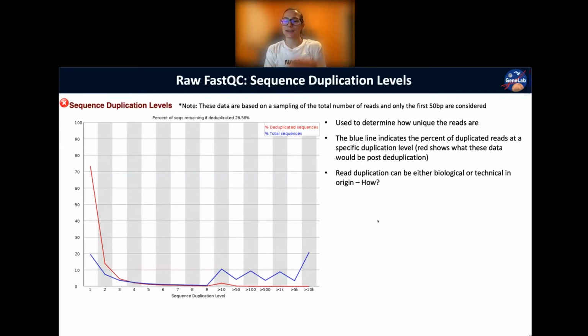although we try, with the divalent cations when we do our chopping of our mRNA, to make that as random as possible, it's always going to have some biases. So if you have exact copies of a transcript, so really high expression of a transcript, when you do the cutting up of that transcript, you can chop at the same location on each one of those transcripts.